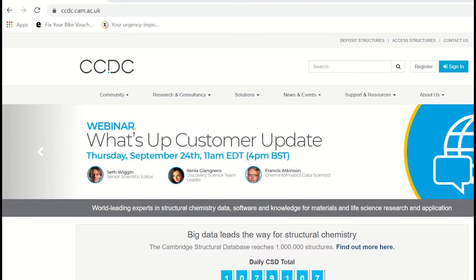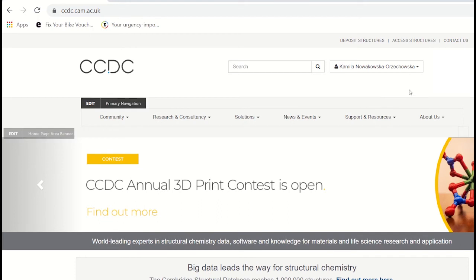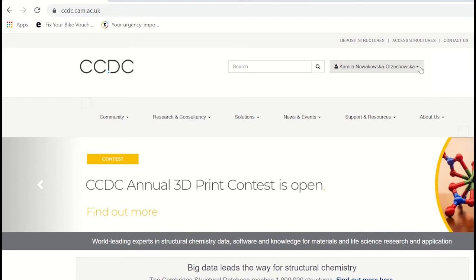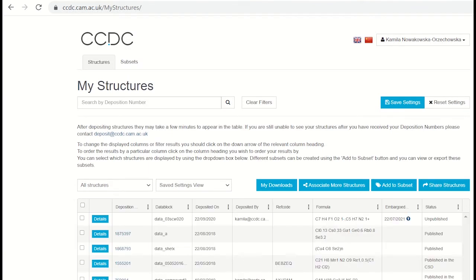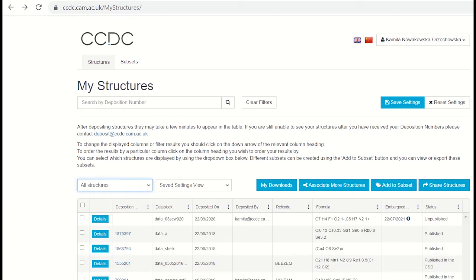Once your data is deposited with us and remains unpublished, you can make it available as a CSD Communication via MyStructures. If you have registered on our website, you can access your deposited structures by logging in and then going to MyStructures on the drop-down menu. From there, load all your structures and select the dataset you wish to make as a CSD Communication.